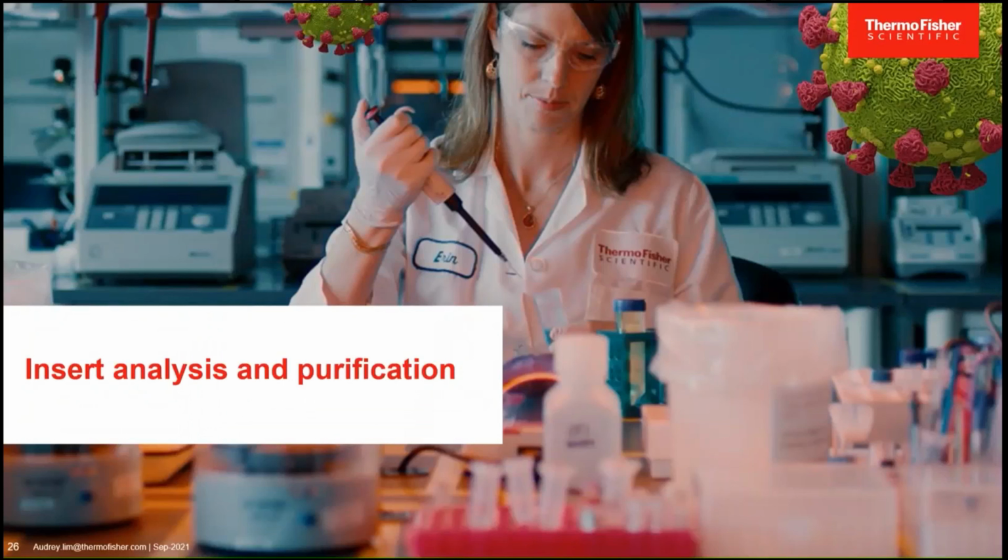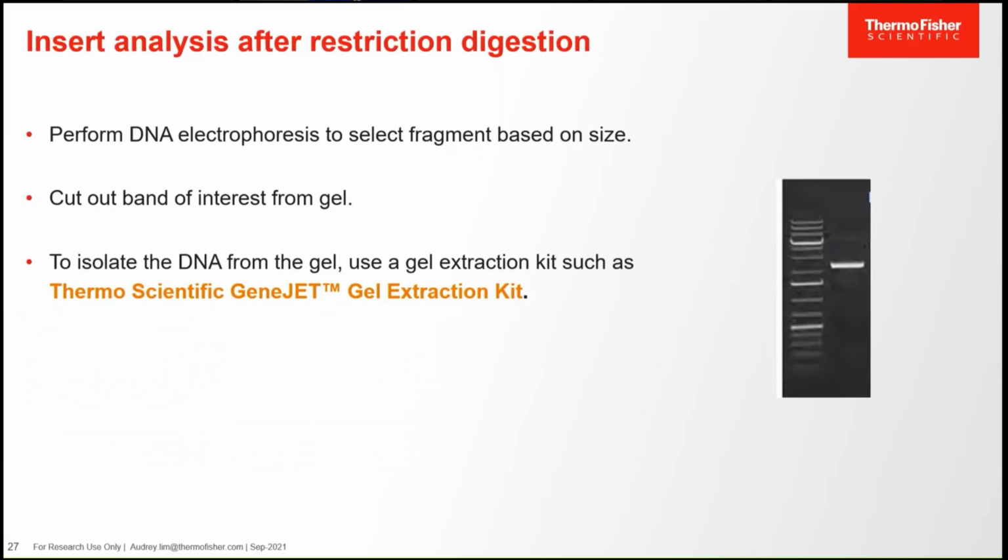After the preparation of your insert and vector, we move on to the next step, which is to analyze and purify your insert. After restriction enzyme digestion, the next step is to perform a simple gel electrophoresis for your digested product to select the correct fragment based on the size.